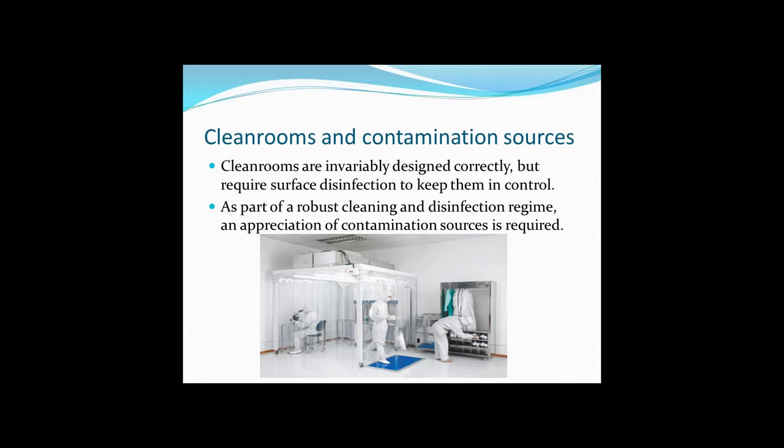And as part of a robust cleaning and disinfection program, an appreciation of contamination control sources is required. So before moving on to look at cleaning and disinfection agents, it is important to consider environmental control in clean rooms and also to review the sources of contamination that might impact upon clean room operations.